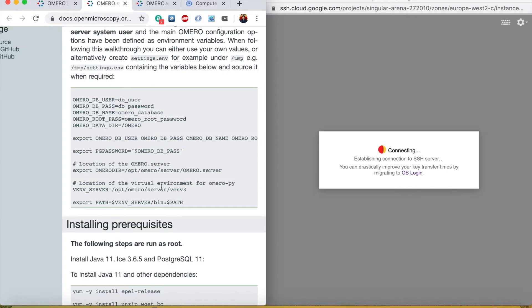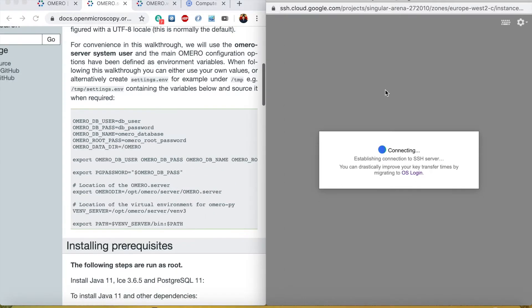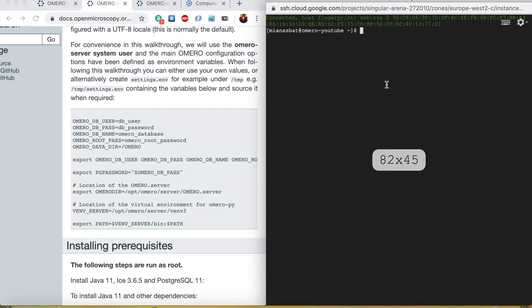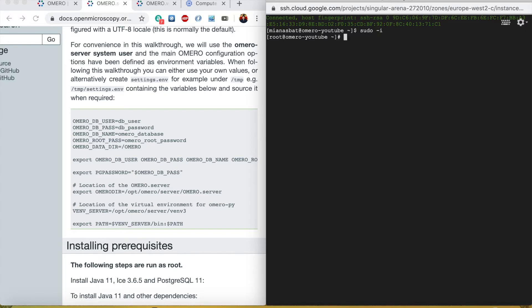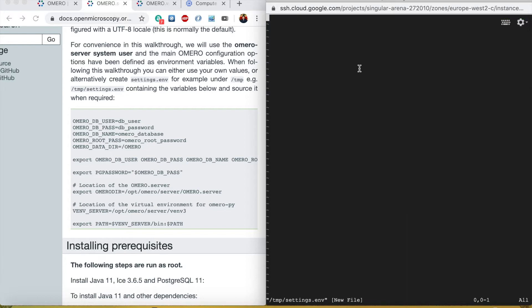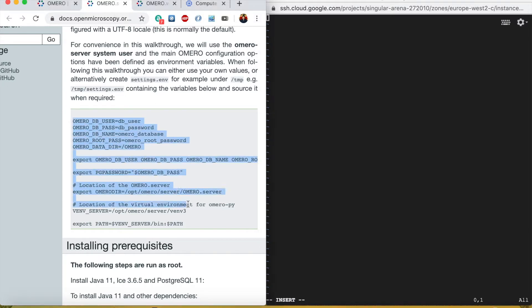The server is still booting. We got to the shell now. What we need to do is sudo dash i to go to administrative mode and then I will create a file /tmp/settings.env and go into insert mode and copy the settings.